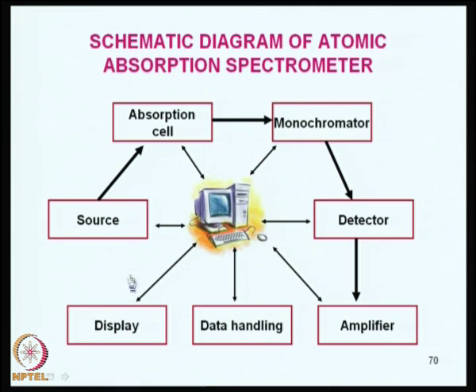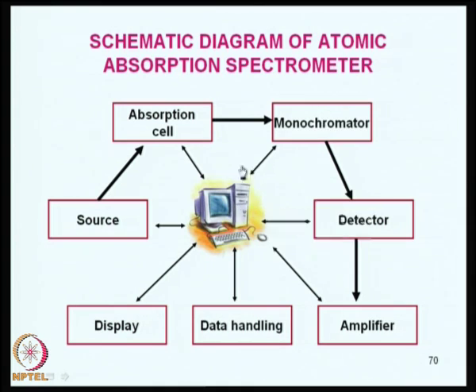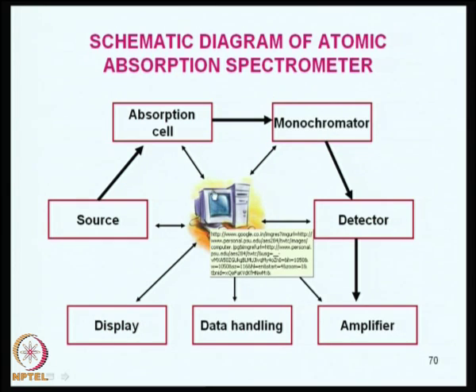Now, you will be surprised to see why I have put a computer in the center. That is because nowadays the instrumentation has become so well organized that several functions of the atomic absorption, or for that matter any instrument, can be handled by the computer microprocessor.